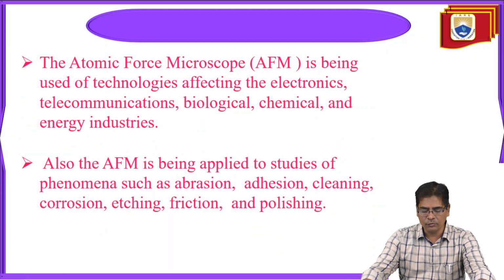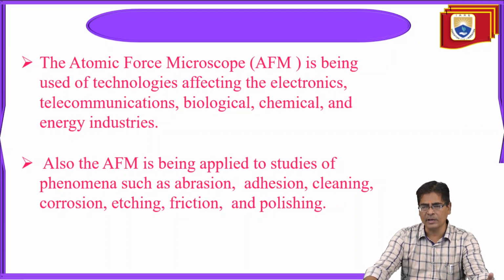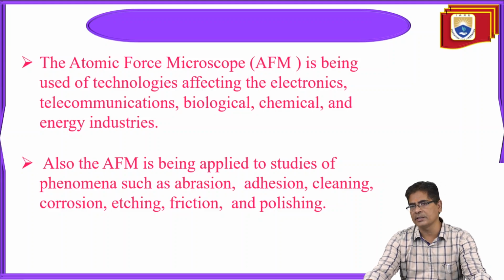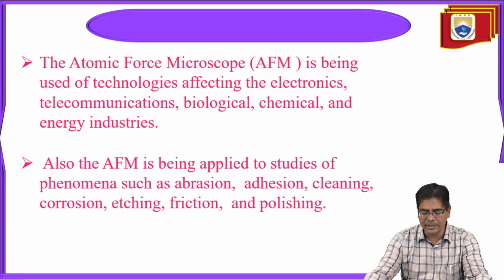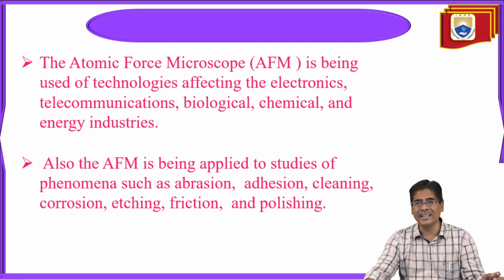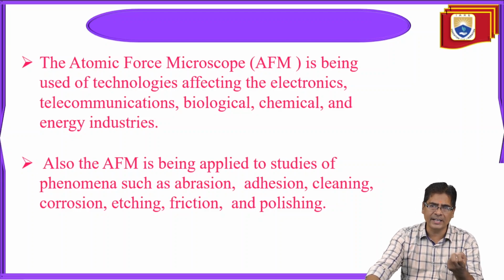So atomic force microscopy is being used in technologies affecting the electronics, telecommunications, biological, chemical and energy industries. Also, the AFM is being applied to studies of phenomena such as abrasion, adhesion, cleaning, corrosion, etching, friction, and polishing. What is abrasion of the material? What is adhesion? How much material is touching that particular surface? We call these adhesive forces.